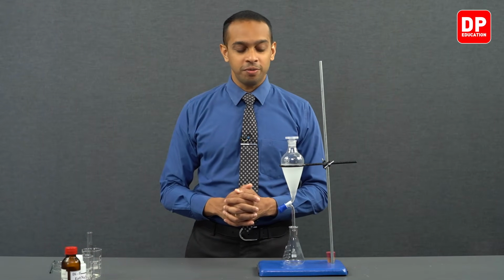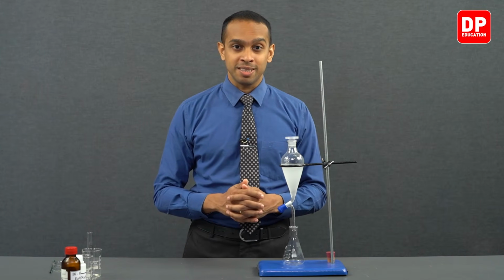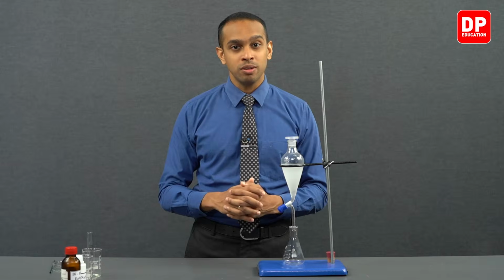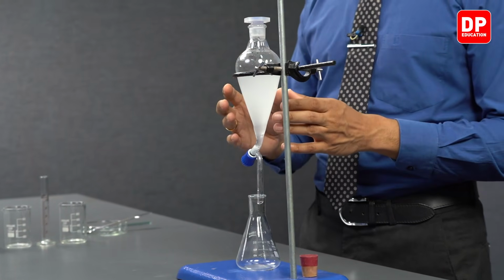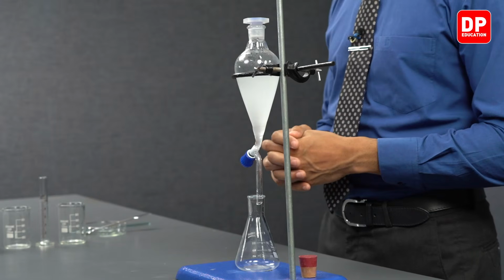Now students, we have extracted an essential oil from cinnamon leaves. You saw how the extraction setup was fixed, you saw how it was carried out, and now we have the extraction over here. So this contains water mixed with the eugenol oil, or essential oil, that we extracted with the help of cinnamon leaves.